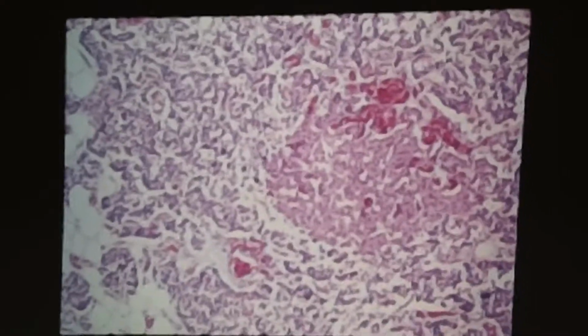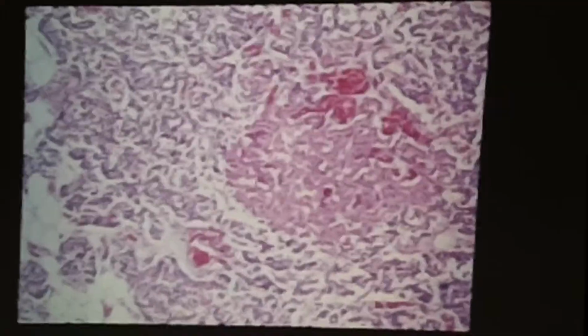Not really sure what oxyphil cells do, but as Harry pointed out, their eosinophilia suggests that they're full of mitochondria. At any rate, the fact that they're pink staining and appear in clusters is a nice secondary characteristic, in addition to no ducts, to tell you you're looking at parathyroid.